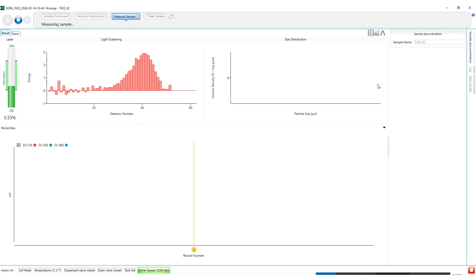Following the guidance from SOP Architect we are now repeating the stability check however with the addition of a stabilizer known as sodium hexametaphosphate which should hopefully stabilize the dispersion going forward. If we now look at the trend view we can see that we have a much flatter line with respect to our DV90 indicating that the dispersion is now much more stable.